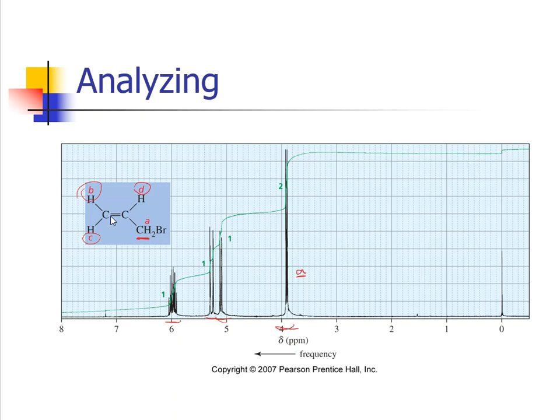So that's why we're starting to see a little bit of pull on D, which makes it even more exposed versus that CH2 group that's just directly connected to the bromine and then to the carbon double bond. So this is kind of the concept of what goes on. These NMRs are not going to be very clean cut every time, and I want you to realize that they are not perfect.